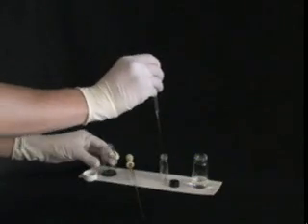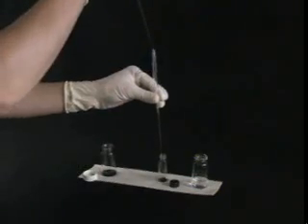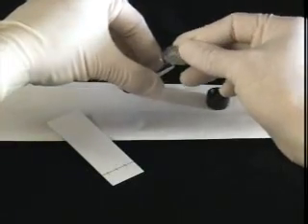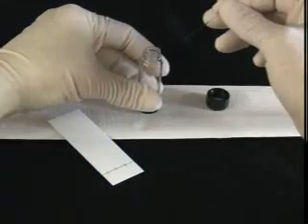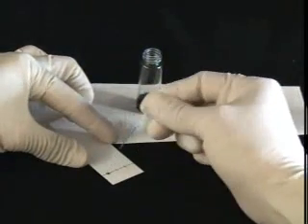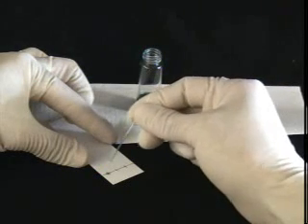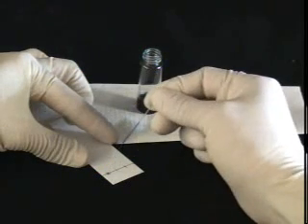Make a TLC sample by dissolving a small amount of your material in approximately one milliliter of solvent. Use this sample to spot several TLC plates and develop each plate in a different solvent system. Make sure that the adsorbent on your TLC plates is the same as the adsorbent you will use in the column, either silica or alumina.